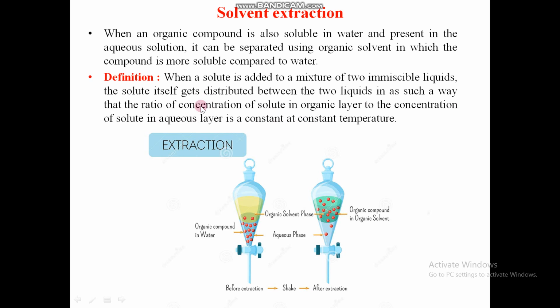Here we have a mixed aqueous solution of organic compounds. This is the aqueous medium, and the red colors are the organic compounds mixed in the aqueous phase.